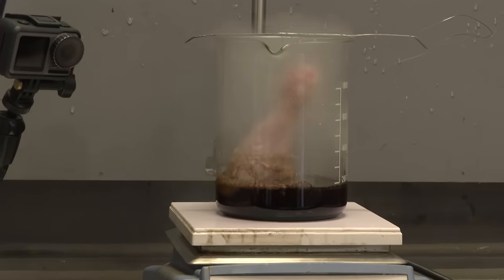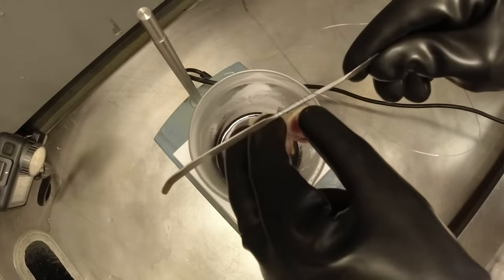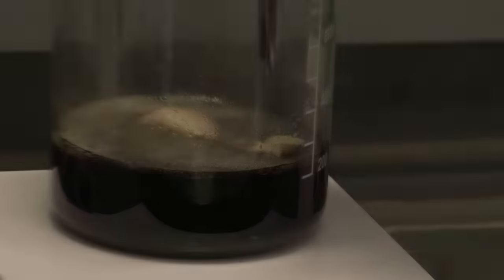The reaction became quite violent, more frothing, and the meat started falling off the bone, something we'd never seen before with other acids.